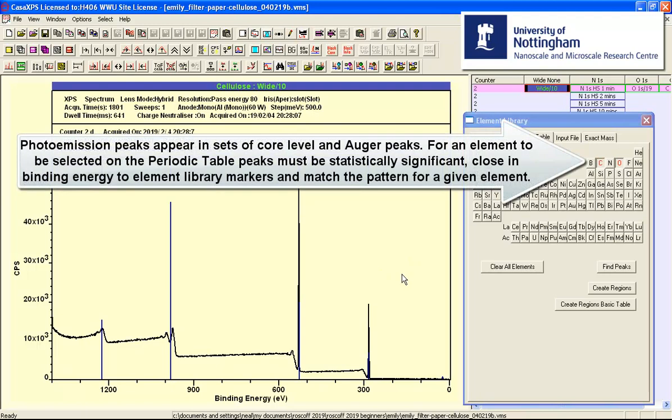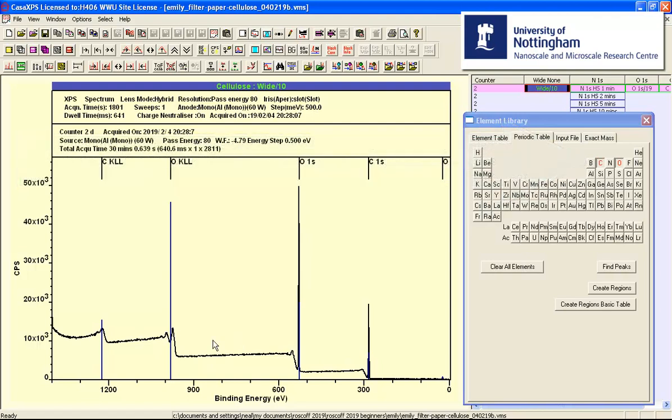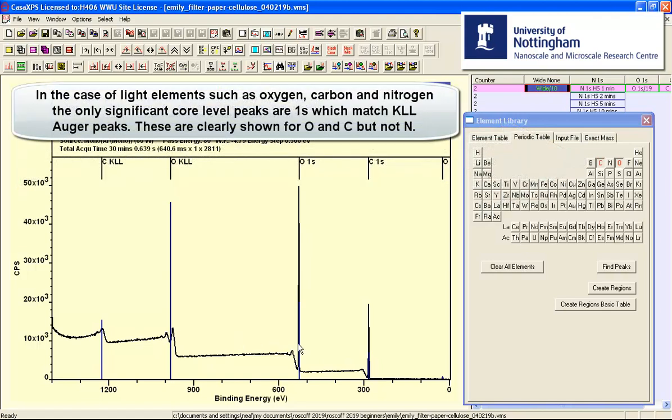Let me just remove the inset tile so that we can see all of these peaks. So having searched these data for peaks that then correlate between peaks for a given element, the only two elements that were identified were the oxygen and the carbon. And that's because we've got peaks at oxygen, peaks at carbon, and we have correlating peaks that are Auger peaks.